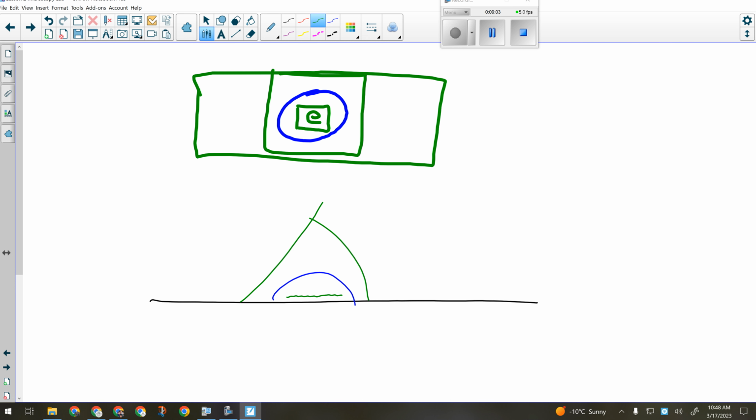So I look at it, and it looks like a letter E. I put it in that way because this is the only thing that we're going to look at whose orientation we can be sure of. I don't know what an amoeba looks like if it's backwards, upside down, or whatever. But I know a letter E. When I look through the microscope, spoiler alert, the letter E is not going to look like this. As the light goes through the lenses, something happens to it. And we're going to look at it that way. Everybody with me on that? So that's the first thing we'll look at.